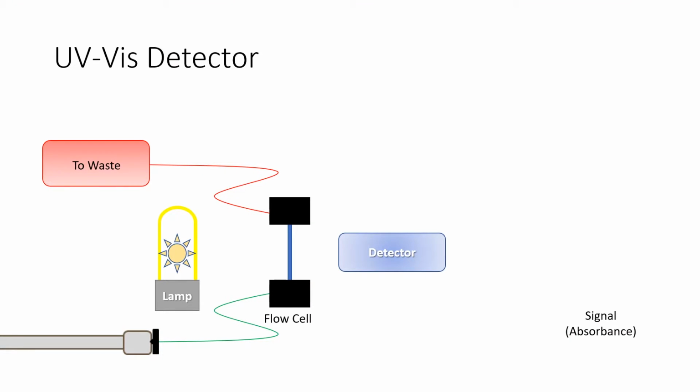So how are we detecting these compounds? We can show you these peaks, but we need to understand what's generating these peaks. And the way this is actually happening is we have our column here. So we've injected a sample, our column and our different compounds are going to elute at different times, and they're going to flow through our tubing here and make it to a flow cell.